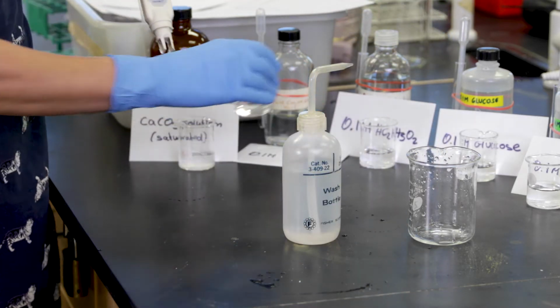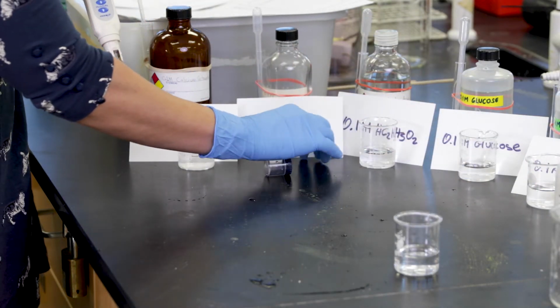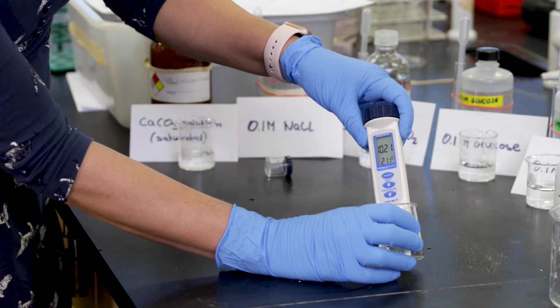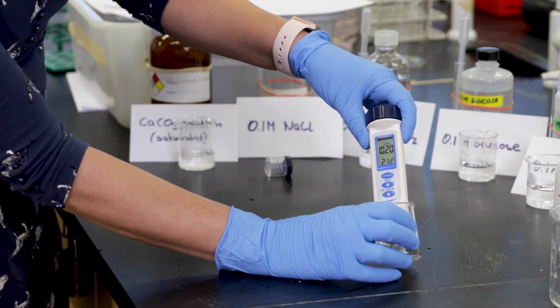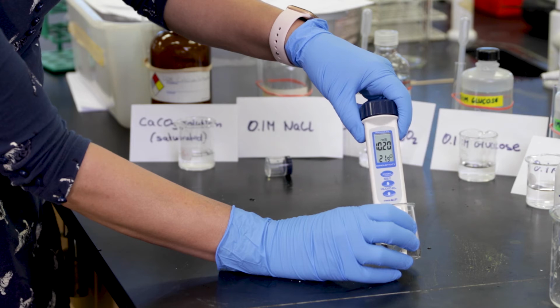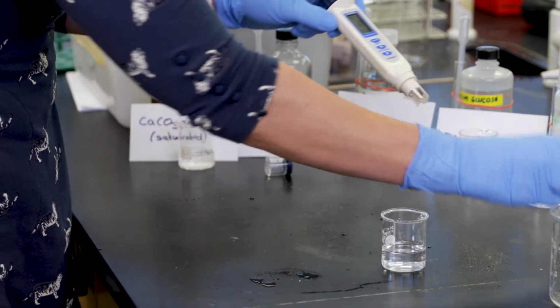The next solution we're going to look at is sodium chloride. Let's see what the measurement says. It says 10.2, and now if you look at the scale, it went up from microsiemens to millisiemens. So this is millisiemens. Let's clean that again.